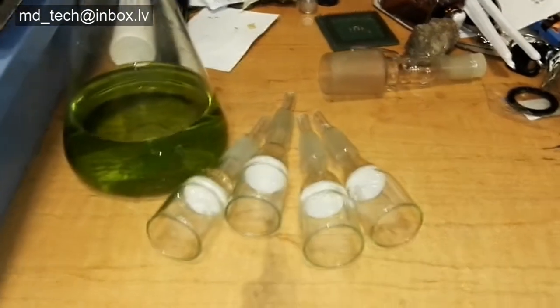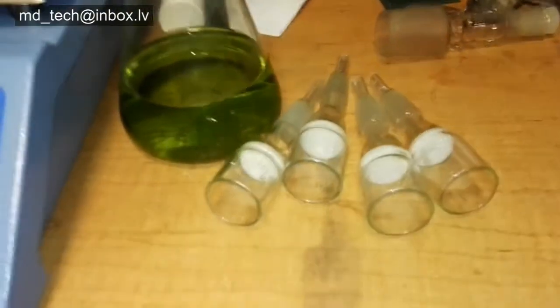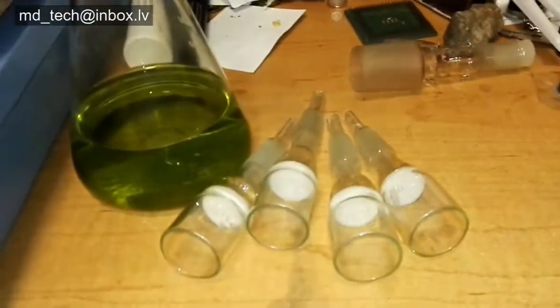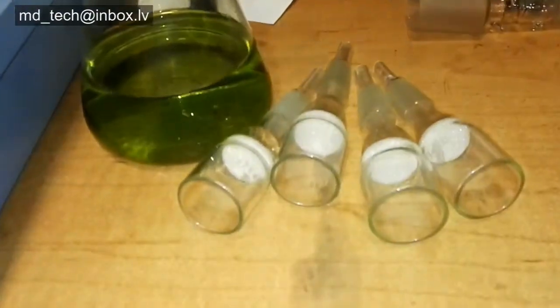Hi, I upgraded my vacuum scrubber reactor. I use glass filters for vacuum filtration of gold, palladium, and platinum water-soluble salts, and any other water-soluble salts.